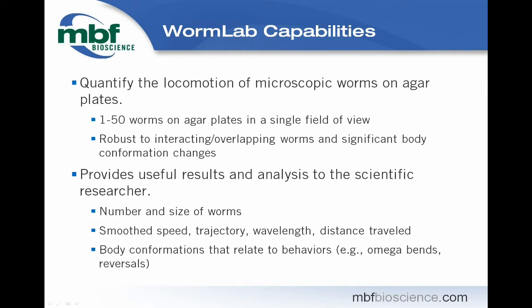This software uses algorithms that fit the worms, which provides many individual details about the worm, including length, width, wavelength, amplitude, and among many others. Wormlab is able to detect and track a number of species of nematodes and at different developmental stages as well.